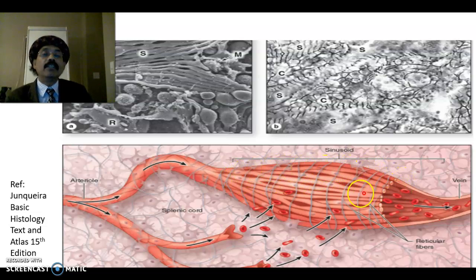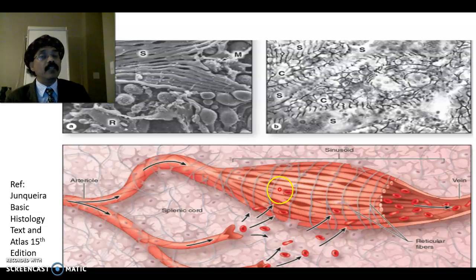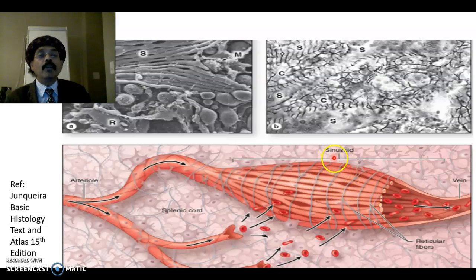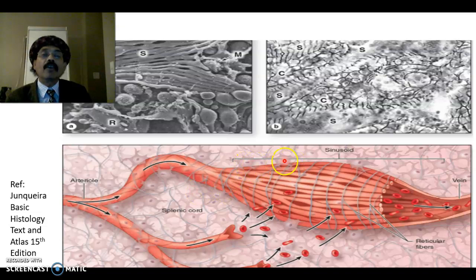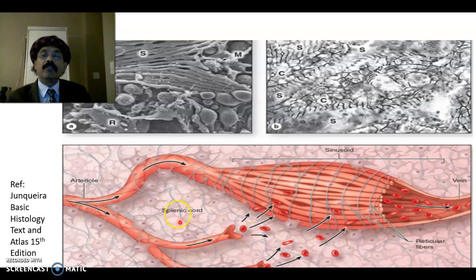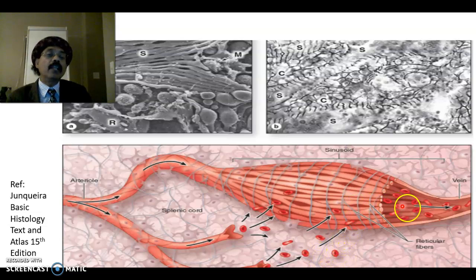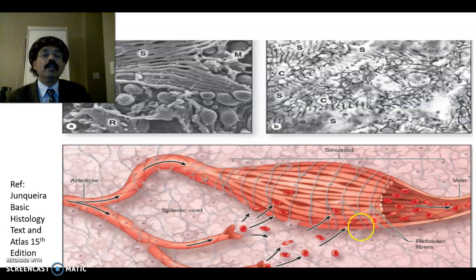This is the splenic sinusoid. These are the endothelial cells — very special, elongated cells called stave cells. We also see some reticular fiber and a lot of macrophages here. Macrophages take out the worn-out RBCs. The RBC must travel from the splenic cord area through the space between the endothelial cells to go to the vein; old cells that cannot pass are phagocytosed.